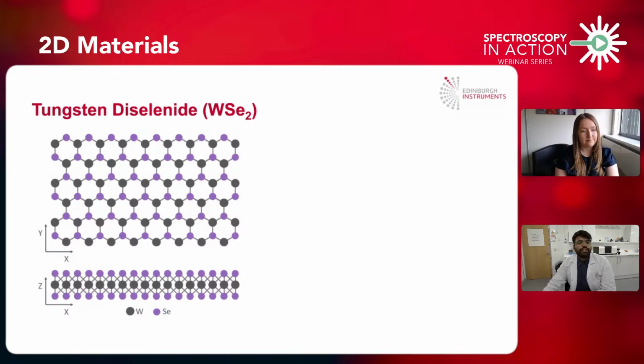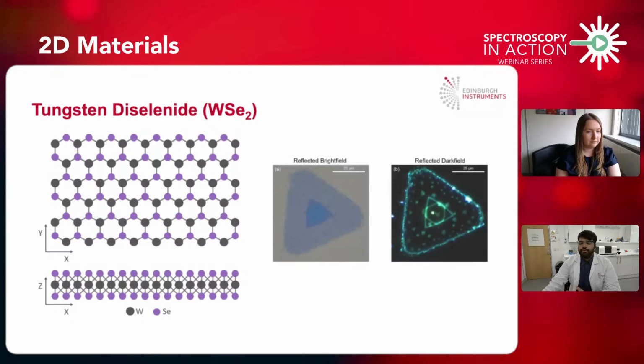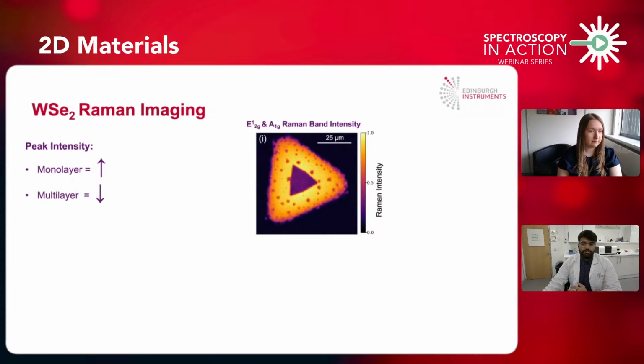Yes, definitely. So this is a 2D material of interest, as it has unique properties in both electronic and sensing technologies. So what we're going to do is take a deep dive into this material, and we're going to use the multimodal spectroscopy techniques that we previously used for the molybdenum disulfide. So on screen now we can see a flake that we've picked, and we've got both the reflected and the dark field illuminations. We can see there are some nice characteristics on this flake, but when we begin to actually run the techniques that I've mentioned, we can build a bigger picture.